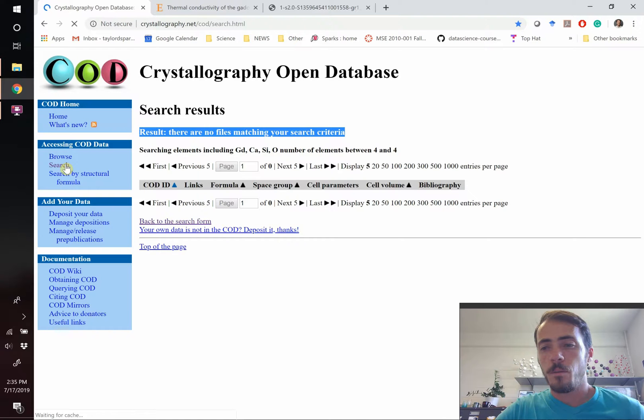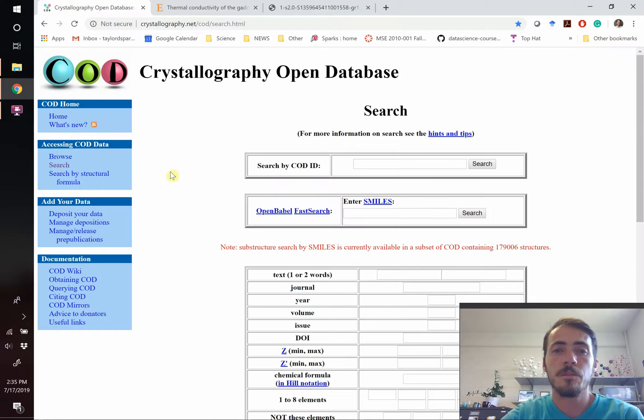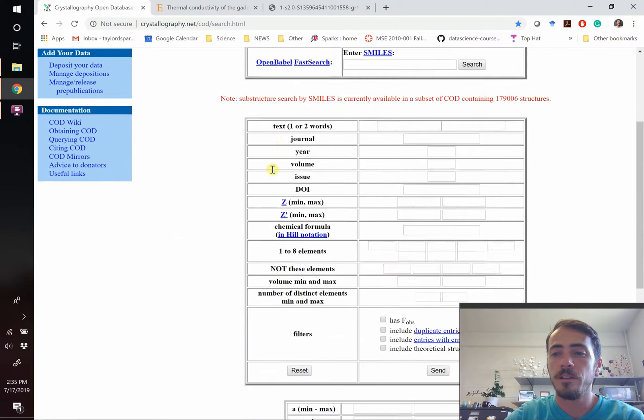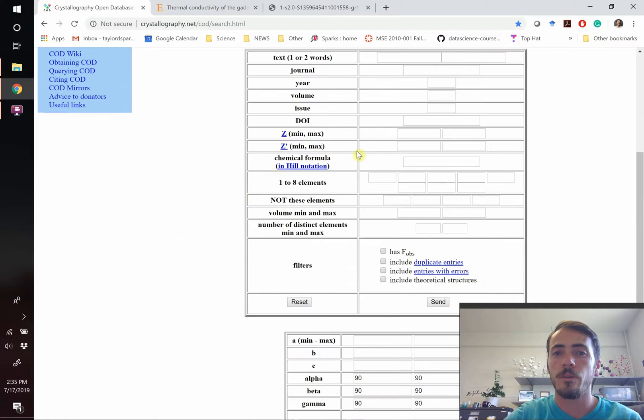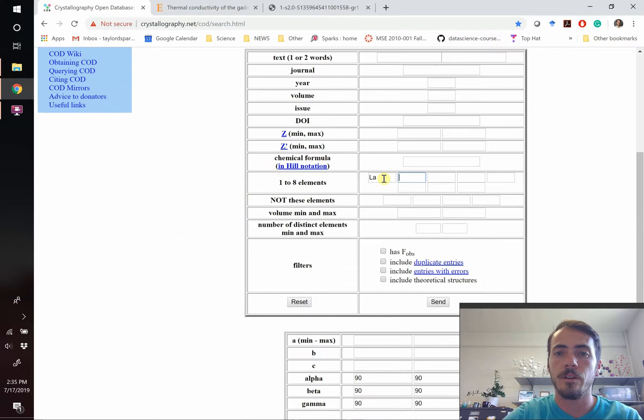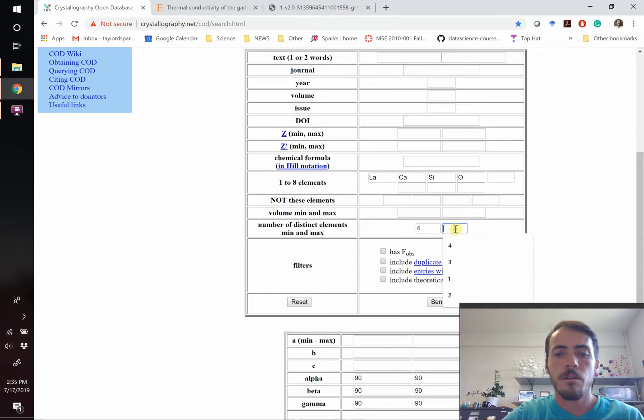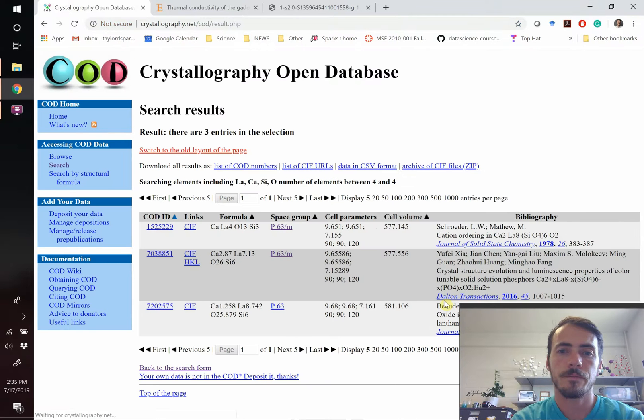This time we know that gadolinium is a rare earth. It's very possible that this is going to be isostructural with other rare earths. So let's go ahead and plug in lanthanum, calcium, silicon, oxygen.